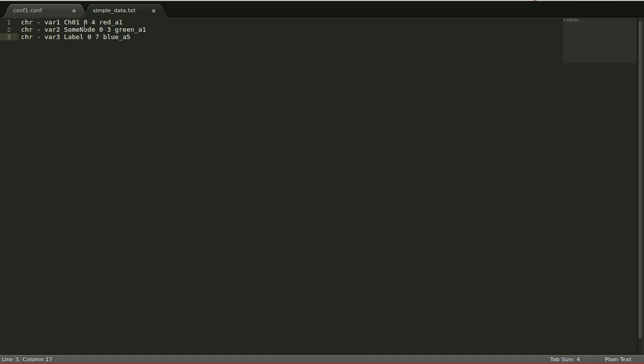Label 3, and I'm going to modify the length a little bit so it could be more interesting to see. 25, like it's 10, 25 is more, 7, modify it, and I'm going to add another one, 4.